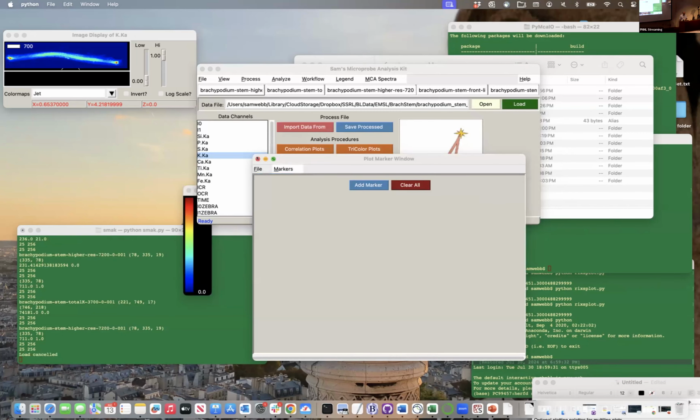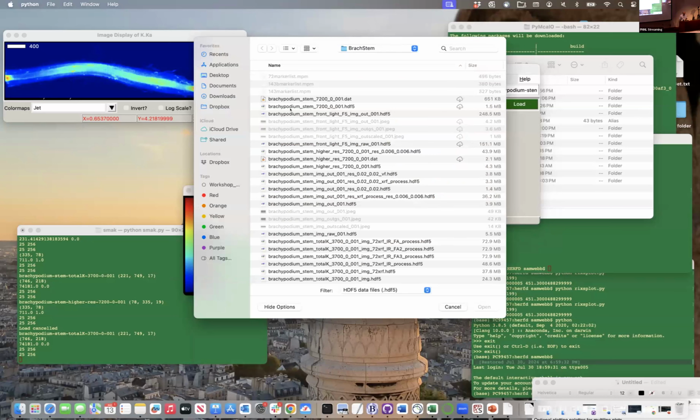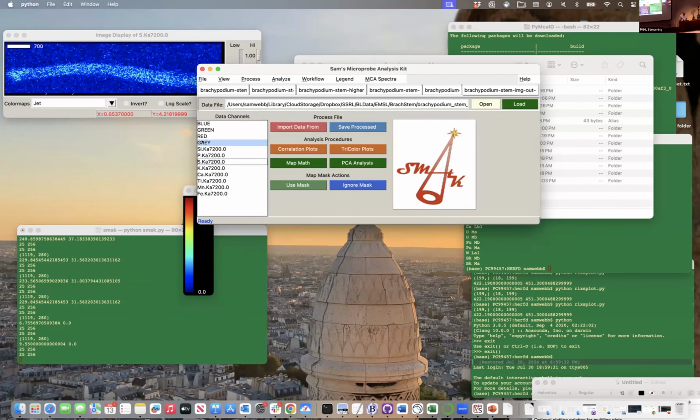We'll tell you what, we're going to cheat. Now look at this one. This one was better. So work with this one. That's what I did. No, that wasn't a very good idea.